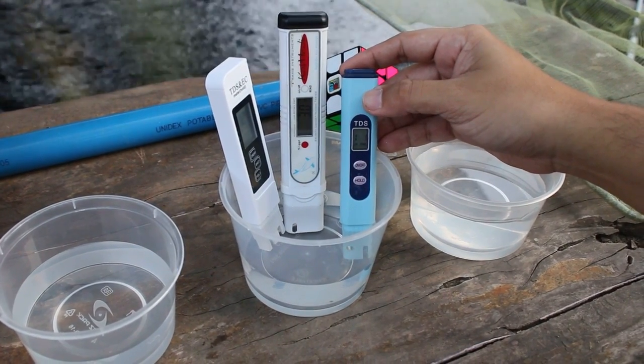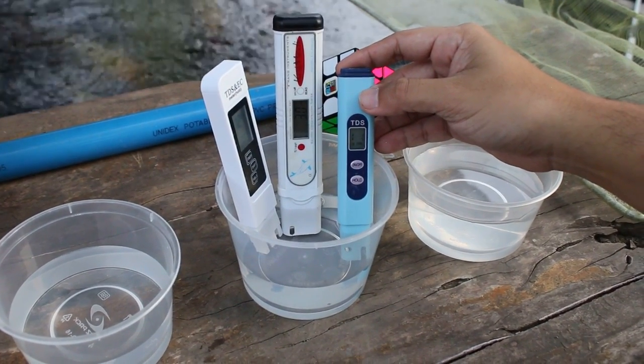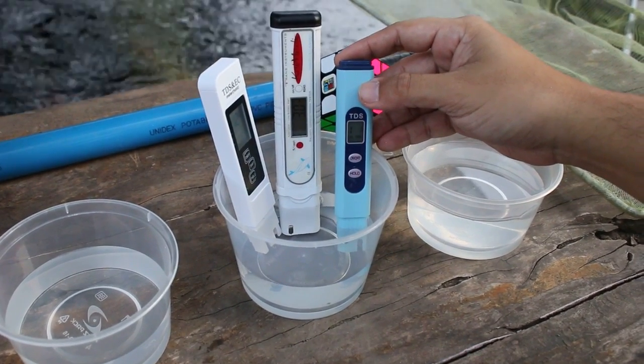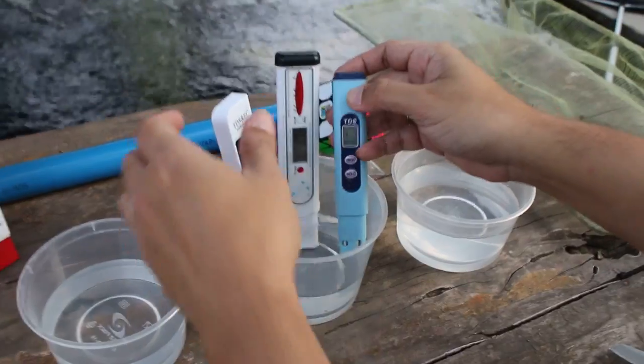That's the reading it's giving me. 1 then space 1 times 10 parts per million. I think there's really something wrong with this device. Anyway, let's proceed to the next.